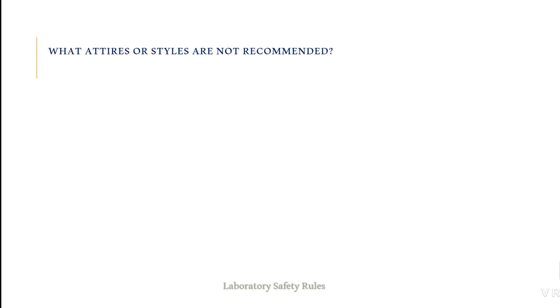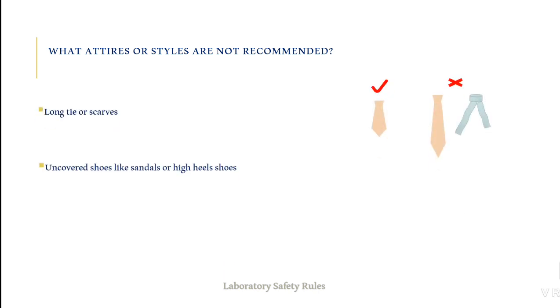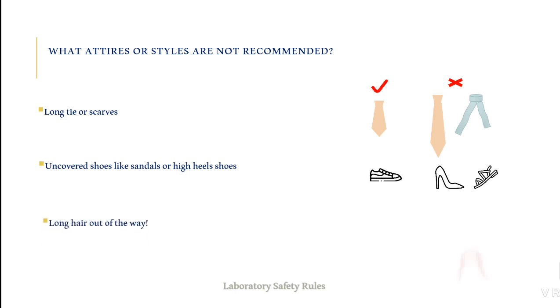To minimize the level of hazards, students are recommended to avoid wearing attires that can jeopardize their safety, including long tie or scarves, uncovered shoes such as sandals or high heels shoes. And it's highly recommended for individuals with long hair to keep their hair out of the way.